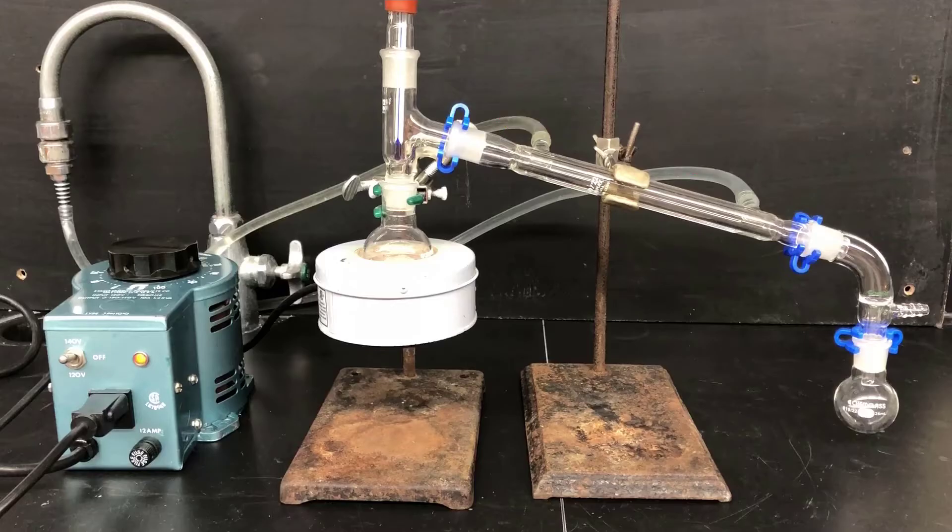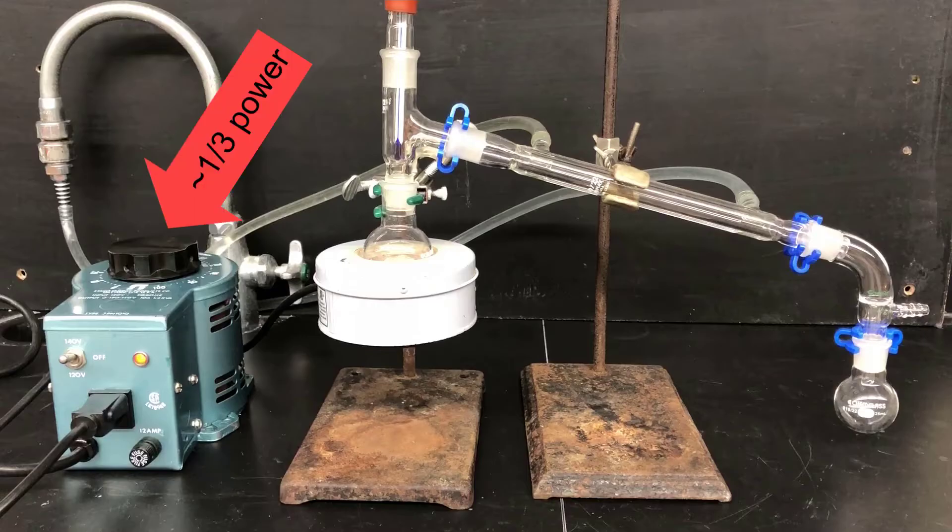Pay attention to the position of the thermometer. The bulb should be just below the elbow of the distillation head — that'll give you the most accurate temperature reading on the distilling vapor. Finally, I have the variable transformer set at about one-third power, which is all you really need for propanal because it's a very low boiling material.